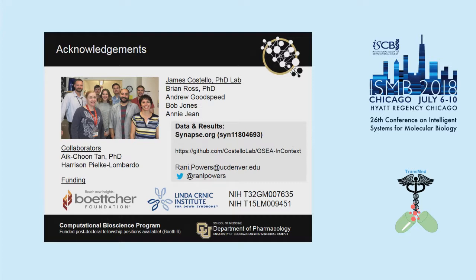Yeah, I think that's fine with the method that we have. We use classic GSEA rather than weighted, so the log fold change values aren't taken into account. The only thing that we use those ranked lists for are the genes themselves, just integer values for the ranking, not the fold change values. It's really just the relative ranking of those genes in the list that the density distribution is based on, not the expression of the genes or the differential expression. Okay, thank you. Very great question.